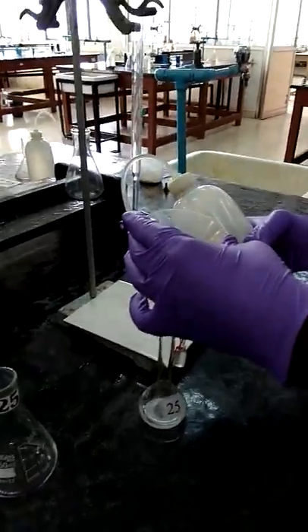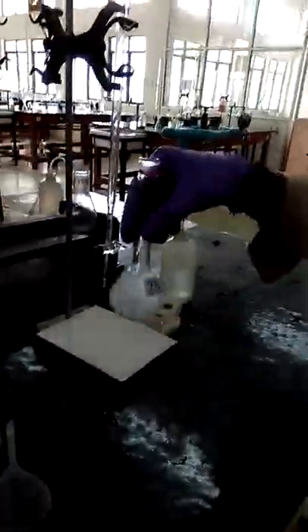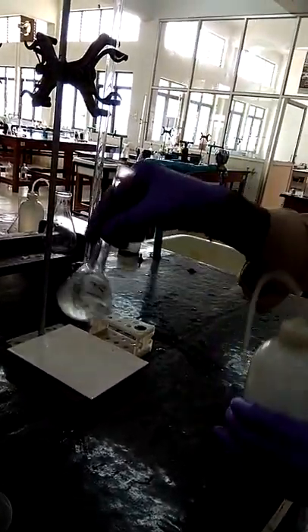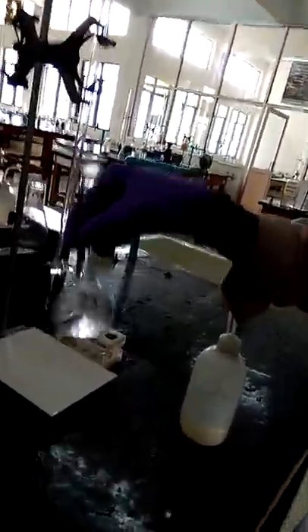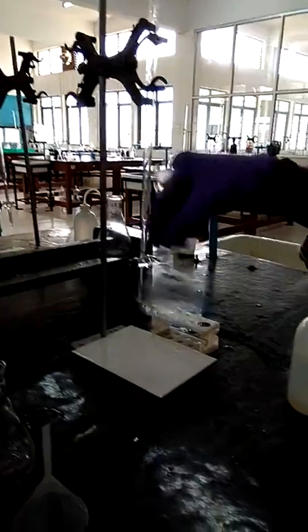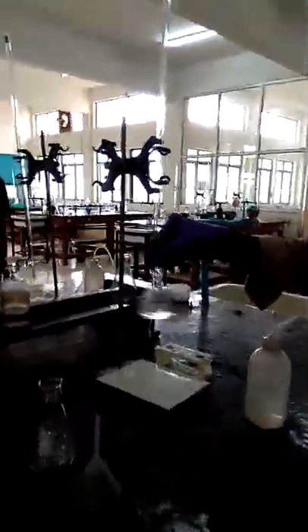Take out the funnel after washing. Then with half a bottle of water, dissolve the salt. You have to dissolve it like this. Keep adding a little water just to increase its solubility. Make sure that the salt is dissolved completely.